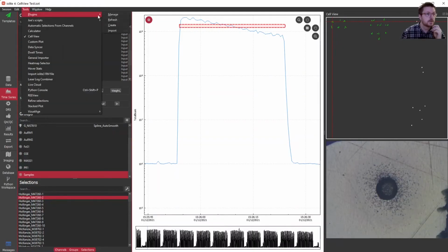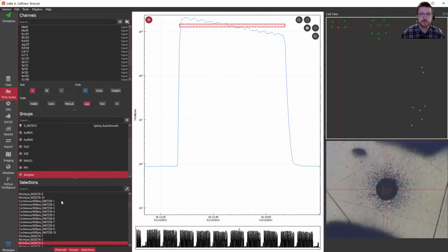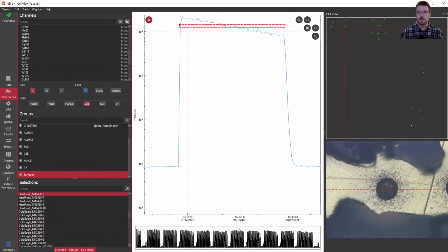Refresh. So there you have it. And I think that just about covers all the features that I was intending to. Performance seems reasonably good. And that's where we'll finish this example.